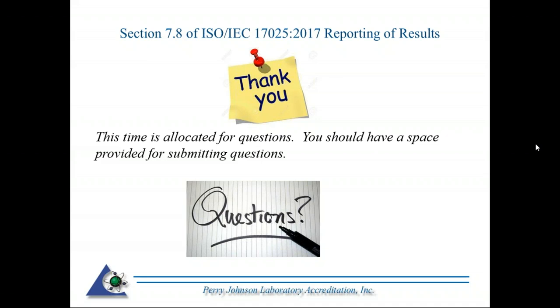What criteria would you compare against to determine whether a calibration factor is too large? Not really sure what you're asking, but if you're looking at the correction factor off a calibration report and you're not having a statement of compliance, say it's within plus or minus so many, if you don't have that pass/fail criteria, the end thing you want to determine is the end result. So if that correction factor adversely impacts your testing or calibration results, then of course the calibration factor would be too large.